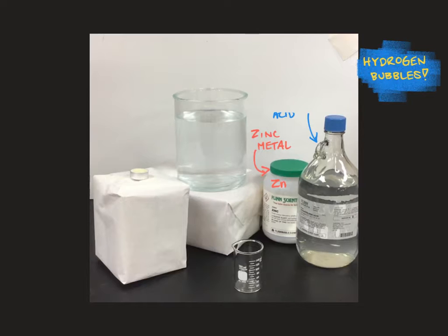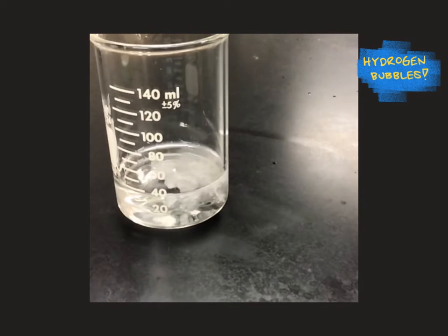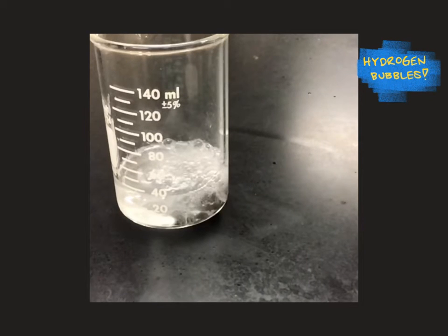Now, as it turns out, when hydrochloric acid and zinc react together, a chemical reaction takes place in which the zinc displaces hydrogen from the hydrochloric acid in what's called a single replacement reaction. In that reaction, you'll notice that we end up forming lots and lots of bubbles, and those bubbles, as it turns out, are hydrogen gas. The second product of this chemical reaction is zinc chloride.